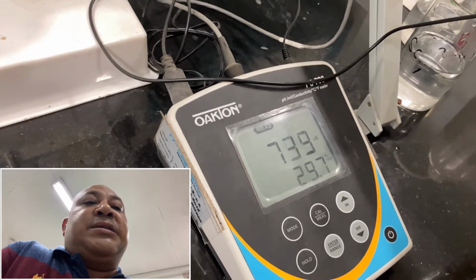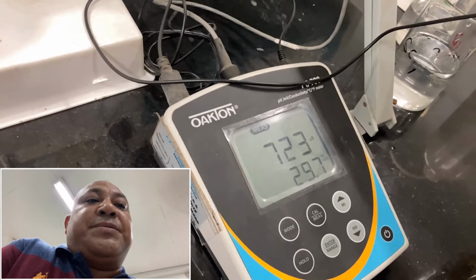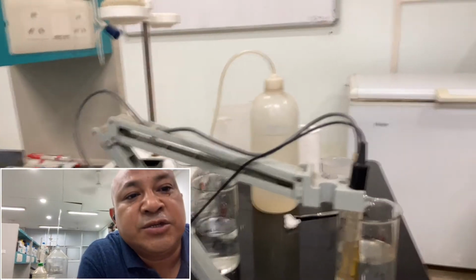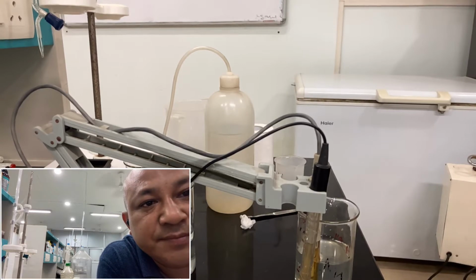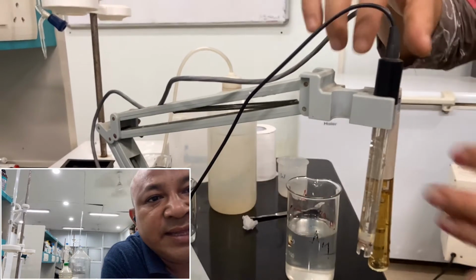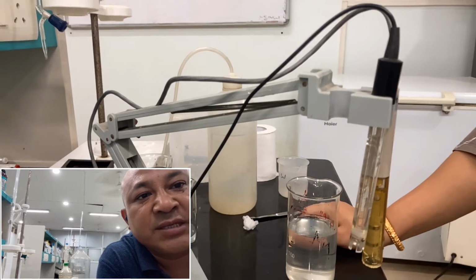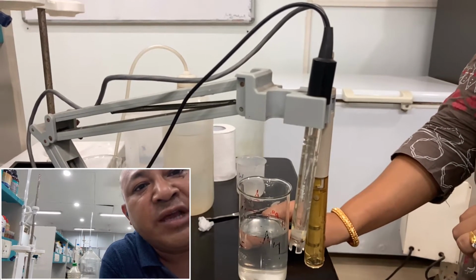Another interesting fact: a student may ask, is simply using a conductivity meter going to solve all the problems? No. As you can see, this rod itself we filled with a KCl solution. This orange rod is filled with an ionic electrolyte that can react with the sample and give the conductivity. Another advantage of this equipment is that it also has a pH meter.